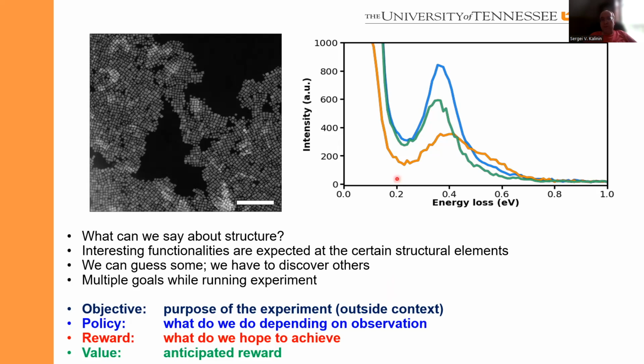This is absolutely not trivial. And in fact, if we learn how to do that, then our life in building autonomous microscopes will become considerably easier, because we would be simply able to take the page from the standard reinforcement learning textbook. But this step, the connection between the objectives and rewards, is really difficult.